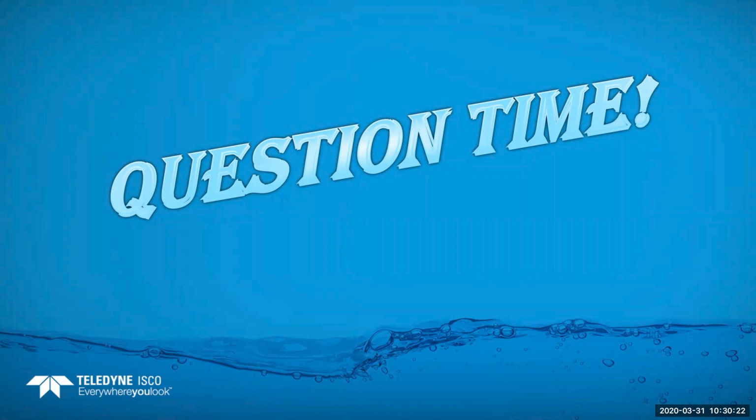But yes, if you want to do two samplers with one flow meter, for our signature models, you would have to have two 306 sampler interface cables. Other manufacturers, other models may have Y cables and stuff like that. Some of our older stuff, I know we used to have Y cables, but pretty much now on the new stuff with signature, you just have to have two 306 sampler interfaces. You can actually have more than two if you want as well.